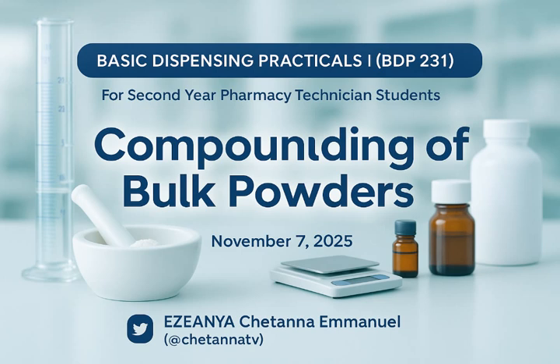If you get a big amount of powder, and you get 2 powders now, one is big and one is small, and you just take the small one and pour inside the big one and start mixing, they will not mix well. Are you aware? They will not mix well. Why? Because of their difference in quantities. Is that clear? So to avoid that, that's why we're using the doubling method.